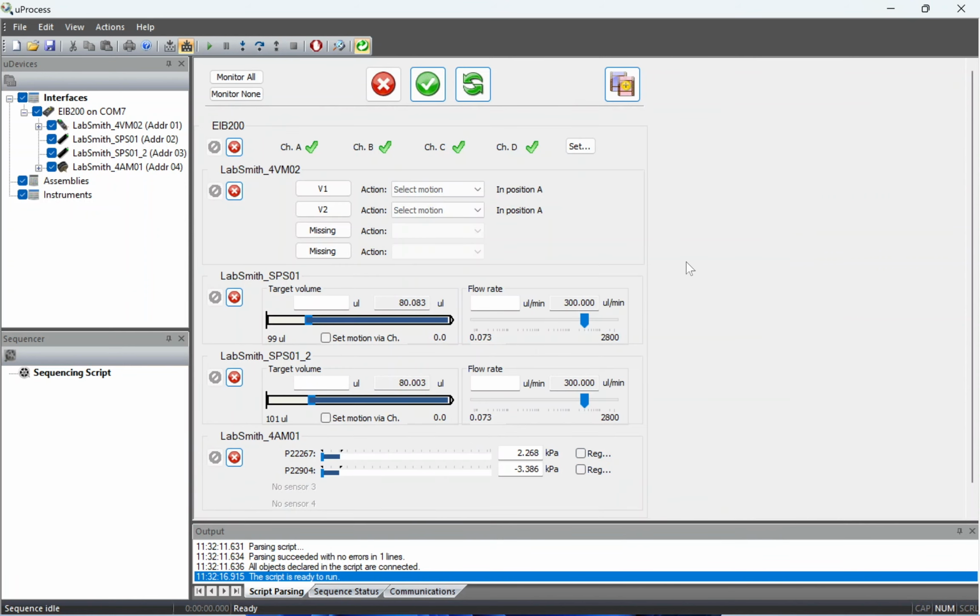If you did not opt for uProcess to automatically name log files, you will now be prompted to choose a file name and a file save location. Otherwise, the file is created automatically, and logging begins at the interval specified earlier. Now, as you change the states of your devices, or if you have connected sensors, then the state changes and measurements are recorded. Data collection continues until you uncheck Log Status/Measurements, click Rescan Devices, or close uProcess.